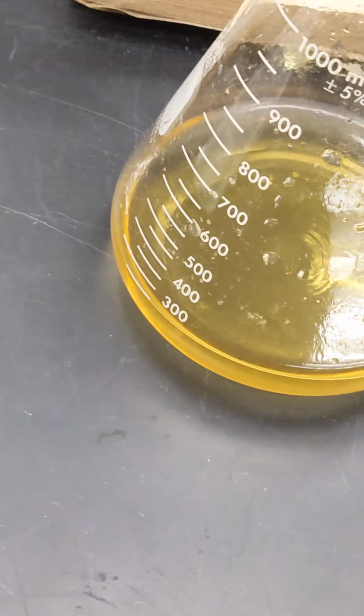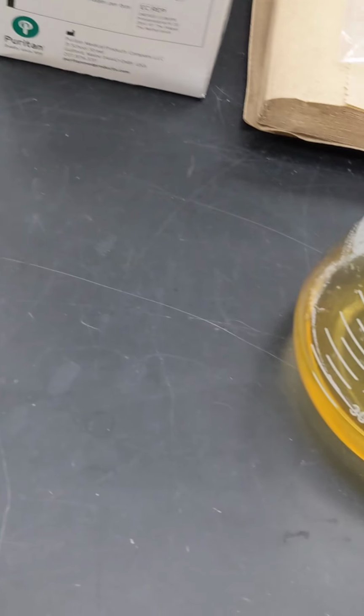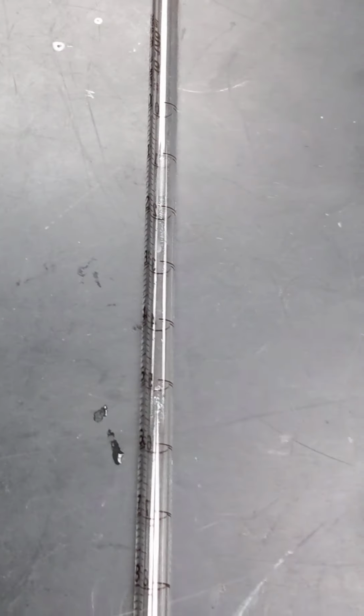Another one that I can do is what's called a deep. Here's a deep I just made, a nice fresh one. To make a deep, what we do is we grab a big transfer pipette that looks like this. And I'll take you on a little more of a walk of the prep room here.